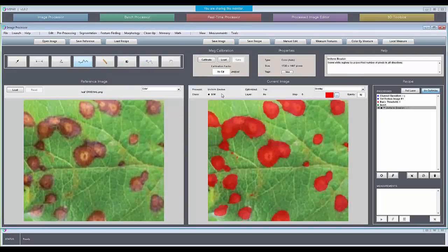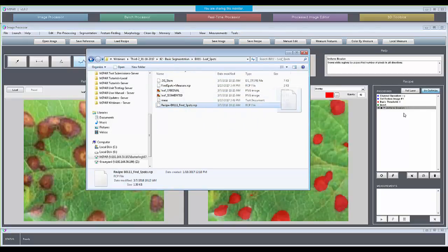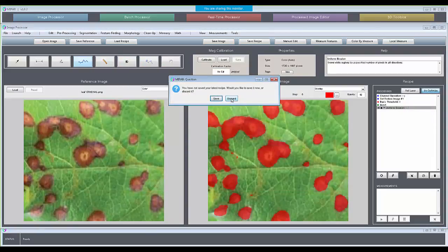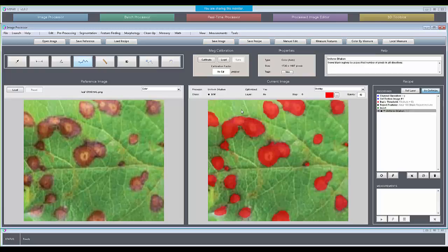And once you have them, no, we don't have a button that you can click that says find disease spots, but you basically do by virtue of being able to load in a recipe that you've made for your problem. So now, every time you've got a leaf disease spots recipe, let's discard that, just load in your leaf spot recipe, and it's effectively as though you clicked a find spot button. So the efficiency, both in building recipes but especially applying them after they exist, is quite nice.